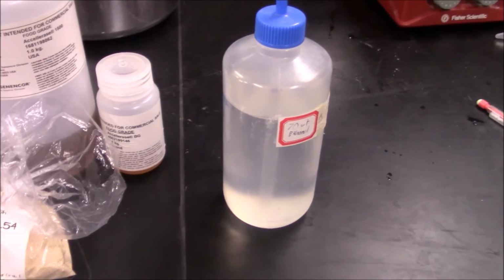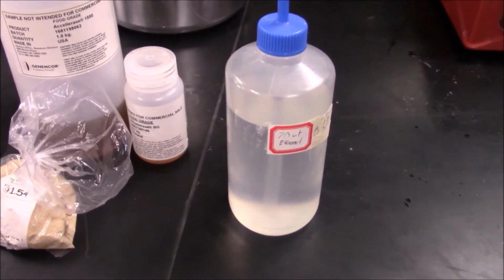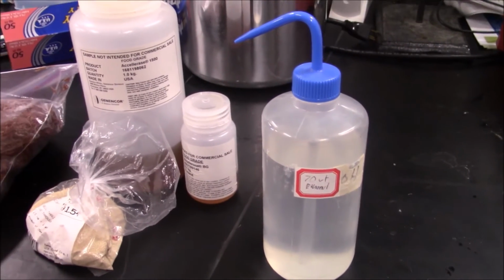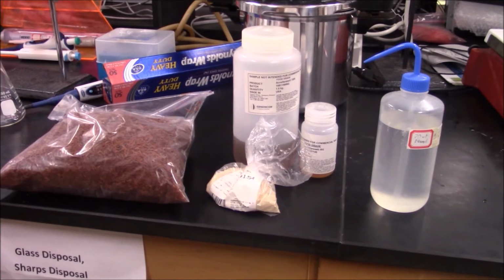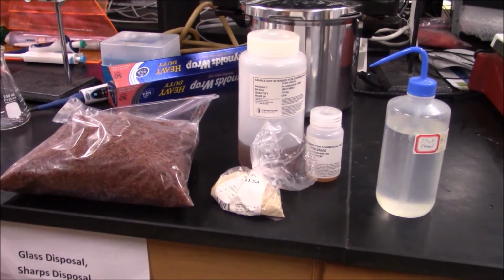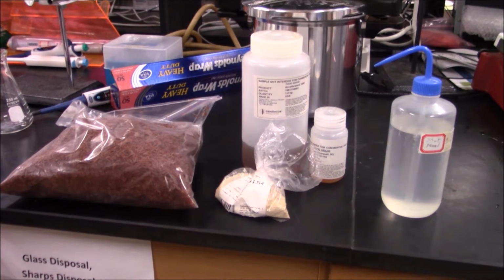After fermentation is complete, the contents of the flask are filtered and distilled, and the ethanol produced during fermentation is separated from the mixture. In real biofuel production, this process would take place at a much larger scale, and mechanisms would be in place to improve efficiency. The basic procedure, however, would remain the same.